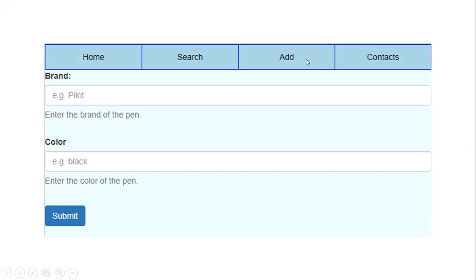You can add the paper or the pen that you're investigating. You can add its spectra, branded color, as well as you can search for pens. And this is the kind of database forensic scientists will hopefully use.